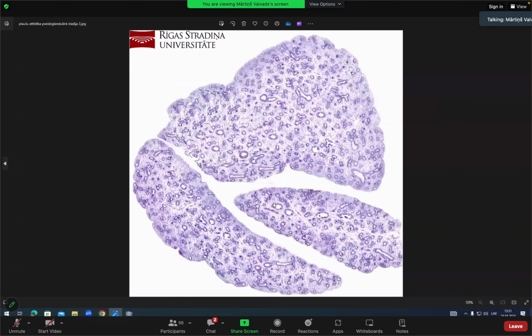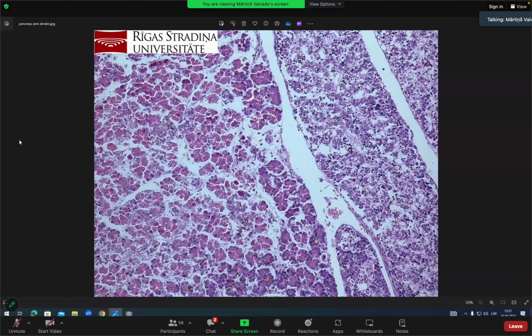I will find it, this one. So this slide also shows the pancreas. So you have pancreas development, same numbers that I used before. And mesenchyme is the connective tissue between the pancreas tissue. So between the serous acini, you see these acini very well. Serous acini are present. But mesenchyme is the slight connective tissue in between. Here in this slide, you also see a liver. So liver tissue appears. No intestines in this fragment, but liver also.